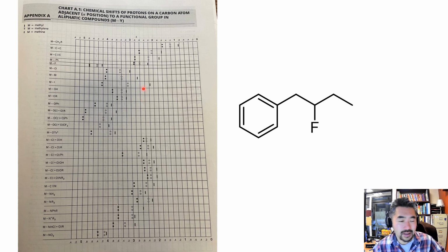I thought I'd make this short video about making use of the chemical shift tables that come with your textbook. And this is something I kind of forgot to mention in the last video for starting your dry lab one, and I apologize for that.